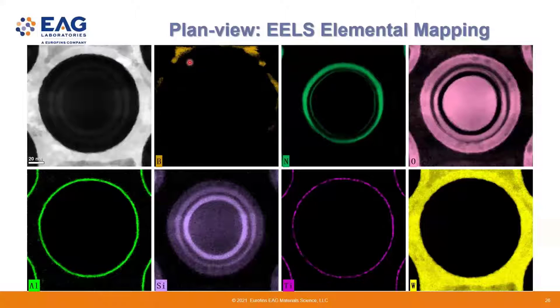To be honest, this is actually the first time I detected boron in my career for a silicon device. Of course, in silicon devices, boron was used for doping. But in this case, I think the engineers used maybe tungsten boride to deposit this tungsten material.